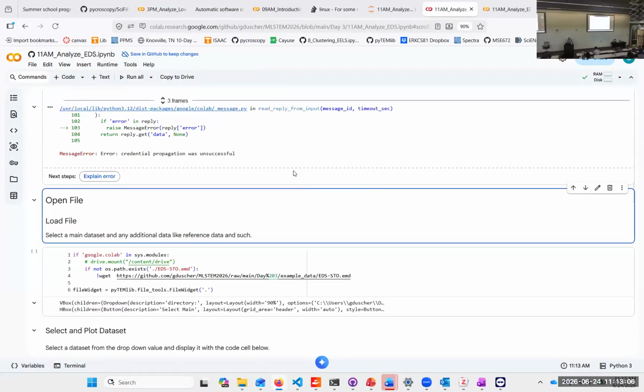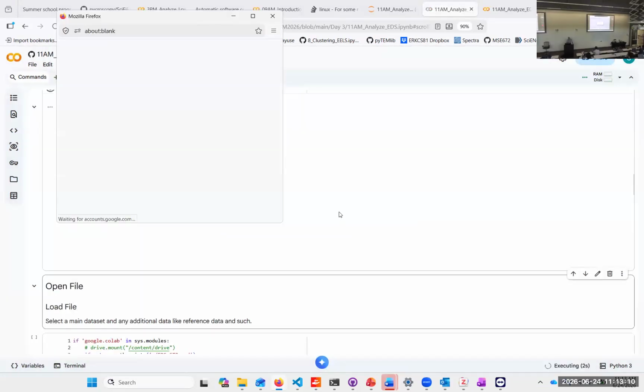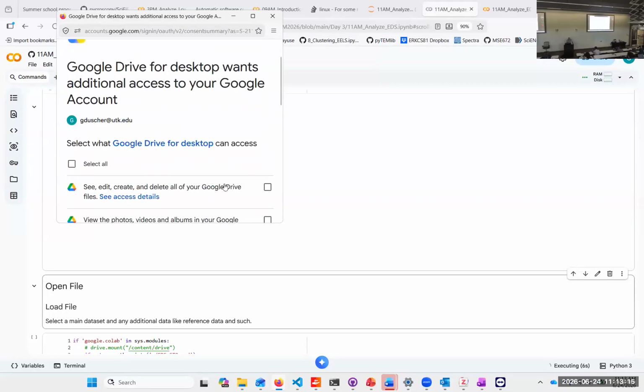You don't need that. Okay. What's going on here?